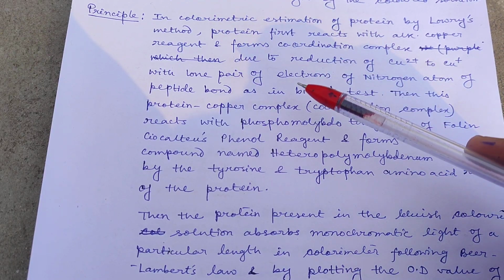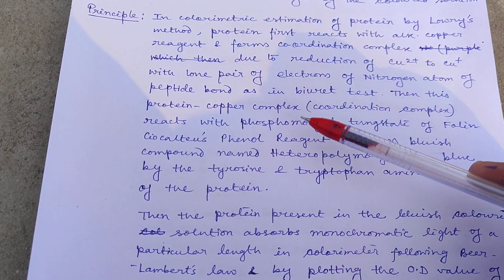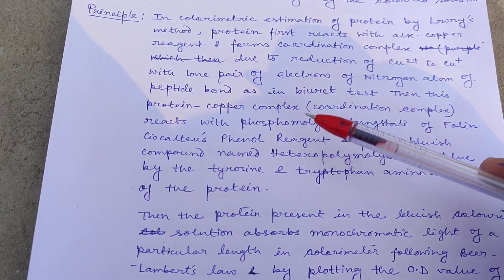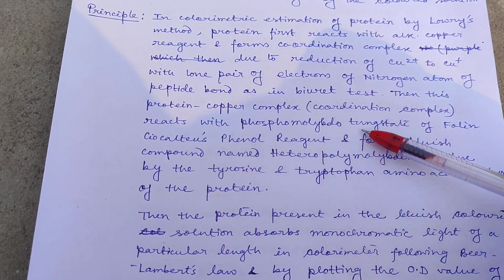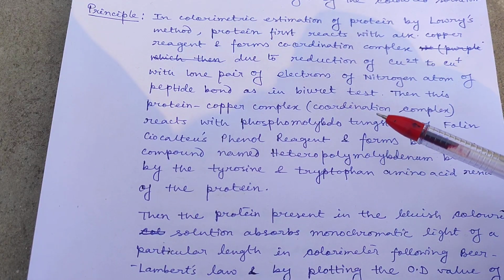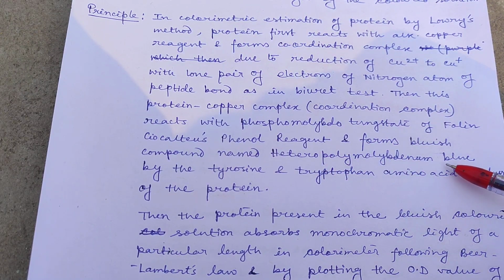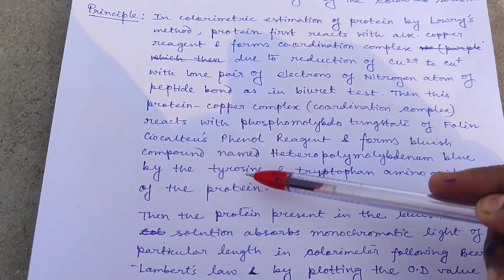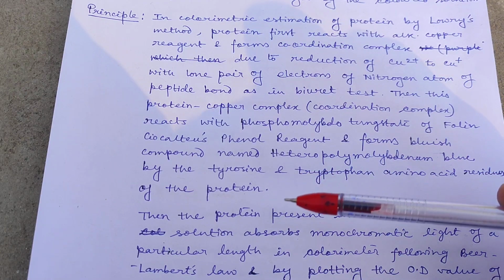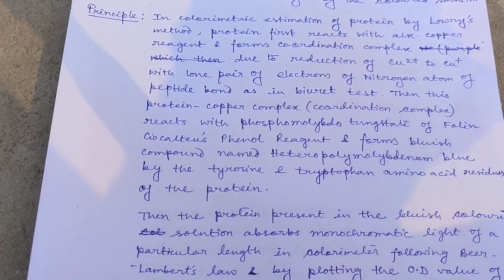Then this coordination complex again reacts with the Folin-Ciocalteu phenol reagent. The name is phosphomolybdotungstate of Folin-Ciocalteu phenol reagent, and they then form heteropolymolybdenum blue, a bluish compound. How do they form? In this reaction, the tyrosine and tryptophan amino acids of your protein take part. And thus a bluish compound is formed.